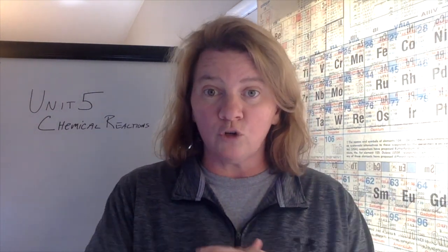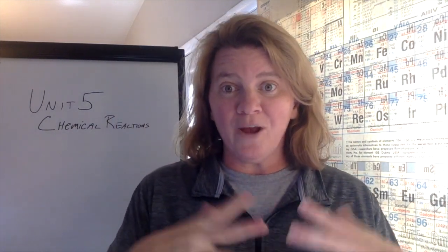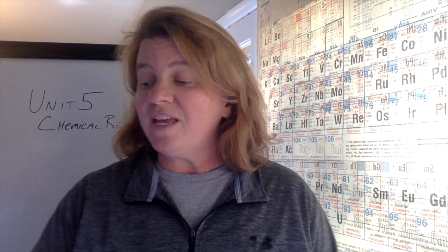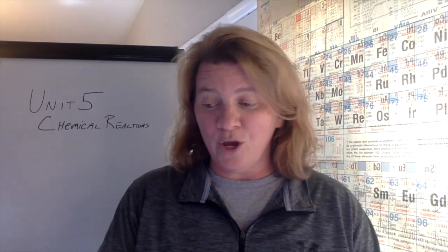Production of a gas. How we know a gas is being formed is we're going to see bubbles. So that's certainly evidence of a change. And then there's going to be one reaction in here where we actually produce light, and that's a really fun one. So you're going to go through in the lab, you're going to watch and make observations of each of the 7 stations that Maurice is going to go through.